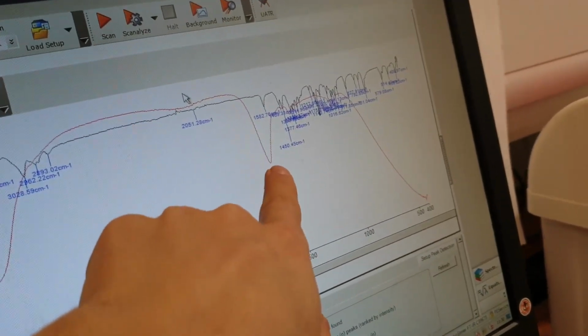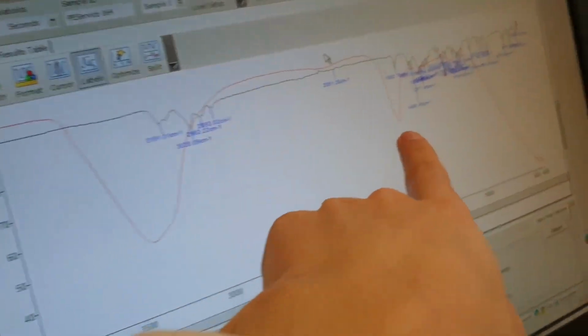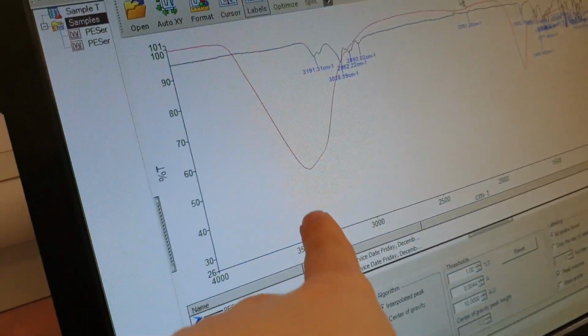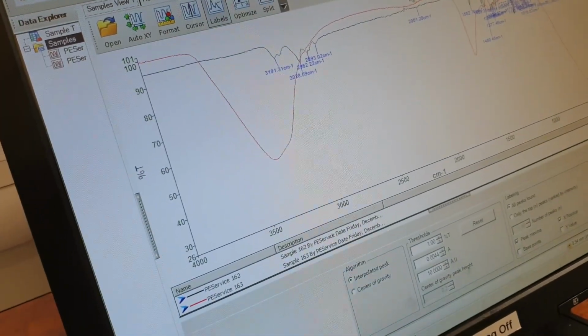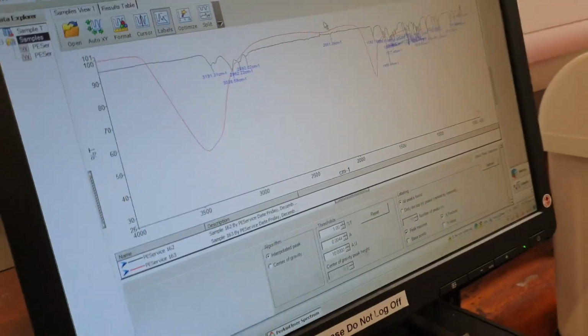We might want to have a look at this peak. This peak is interesting because it is reasonably sharp. I think it's about CH or CC stretch or something. It's not going to be CH bend. Oh, CH bend maybe, yeah. And then here we've just got our hydroxyl peak because it's a solution in water basically, and a bunch of hydrogen bonds. So there we go. That's soy sauce. Okay, cool.